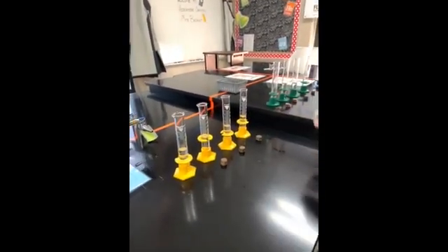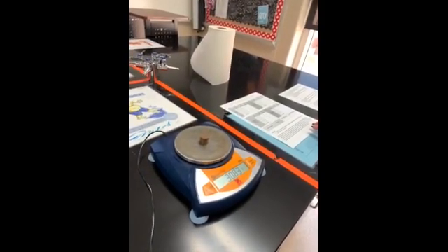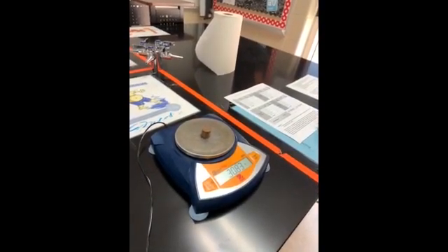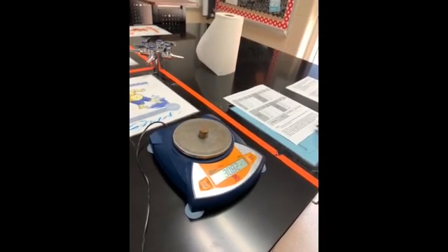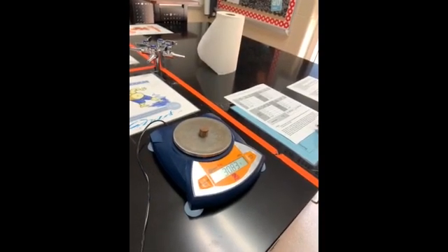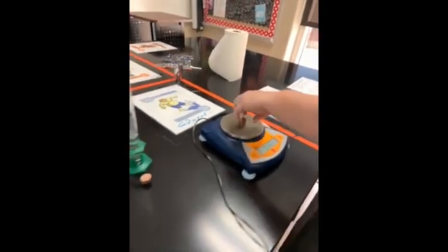Trial 1, we're going to come over here to the balance, carefully place those on the balance. I'm not going to read that out for you. You can read that. Make sure you write down all the digits because the last digit is estimated, which is why it's not necessarily staying still. All right, now let's get trial 2.